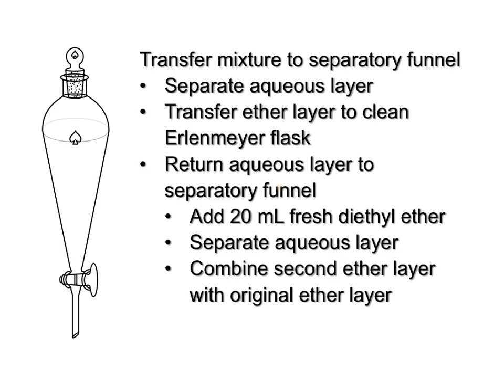So then we will transfer the contents of the round bottom flask, this ether aqueous two-phase mixture, to our separatory funnel. So we'll need to detach our separatory funnel and now use it as a separatory funnel instead of an addition funnel, right? And we should then get two phases, right? Since ether is less dense than water, our aqueous phase will be at the bottom.